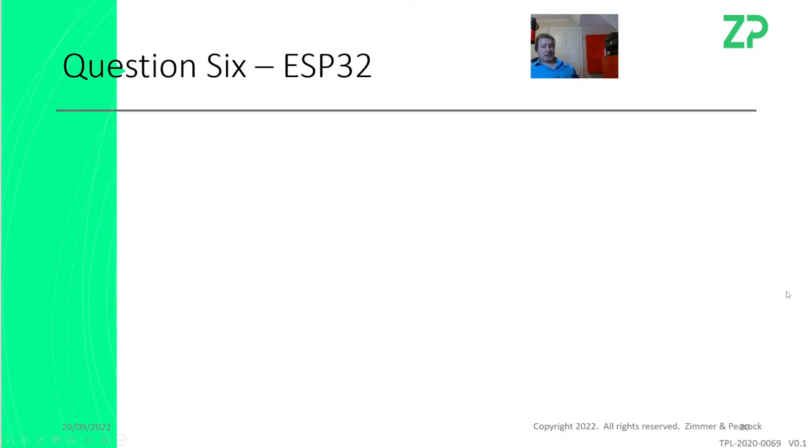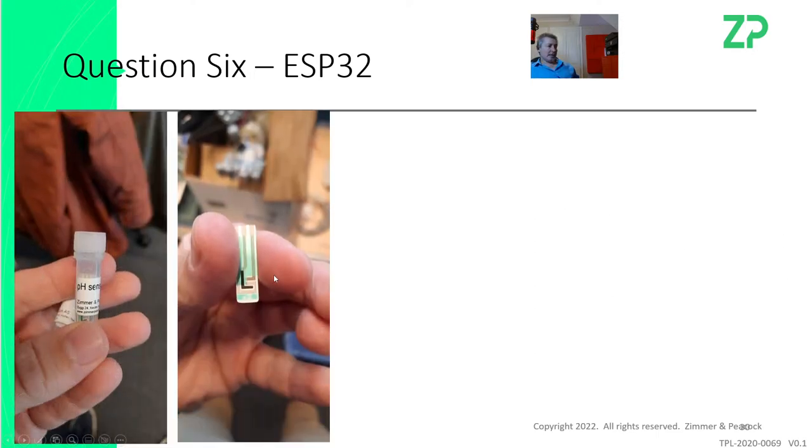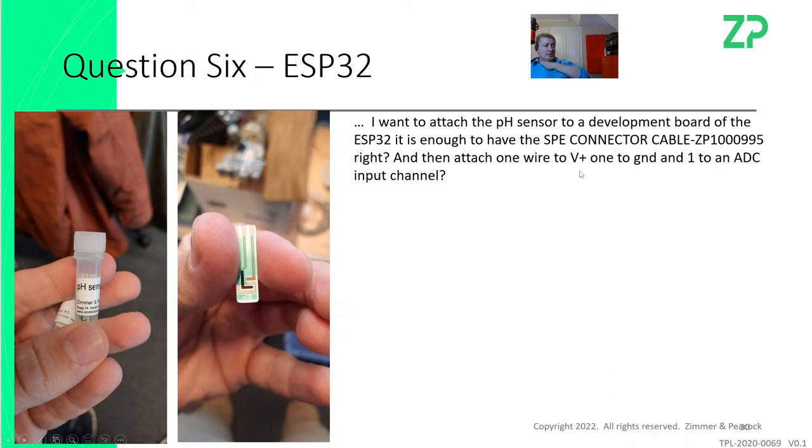Coming close to the end here, ESP32. We're delighted that somebody's using one. It looks like one of our hypervalue pH electrodes. I really appreciate them using it. They were asking a question about using an ESP32 to actually measure the pH probe. I actually didn't answer this one. I just took it straight to one of our engineers who uses ESP32.